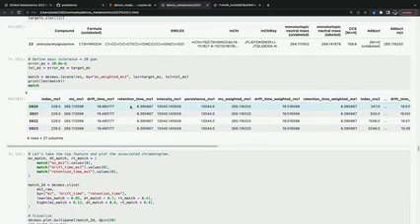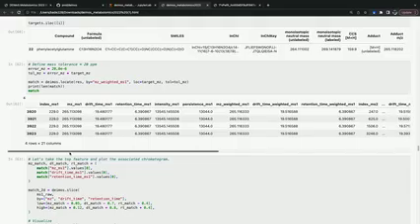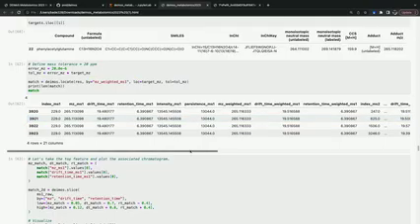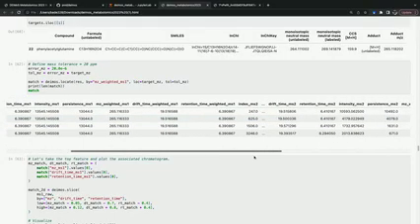What we get here is a list of matched features. You can see this feature in MS1 at 265.11 is fairly close to our expected adduct m/z here. And then each row corresponds to a fragment peak in MS2.